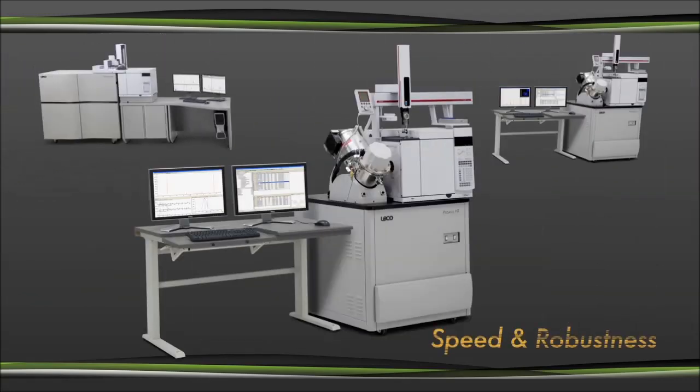The speed and robustness of the Pegasus HT-GC-TOF-MS make it a staple among leading laboratories.